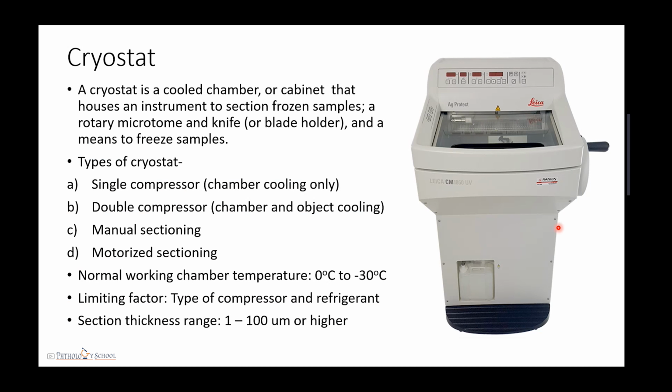So this is the cryostat, which is a cooled chamber or cabinet that houses an instrument to section the frozen samples, a rotary microtome and knife or blade holder, and a means to freeze the samples. So this is the cryostat instrument.